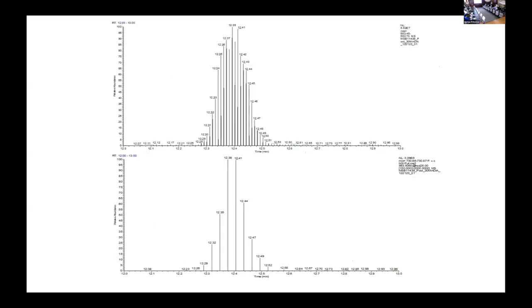If you take this same sample and run it on a 30-minute cycle time gradient instead of 15, now there's plenty of points across the peak. I might even argue there's too many. Mike still wants twice that many, but I'd be happy with a couple less. So maybe a 20-minute or 25-minute cycle is reasonable. I should add, this is a 2 Thompson window across about 500 Thompsons, I think 380 to 980. As fast as that instrument scans, you don't get a pass on matching it to the chromatography. Just because you can run reproducible gradients at 5 or 10 minutes doesn't really mean that you want to.